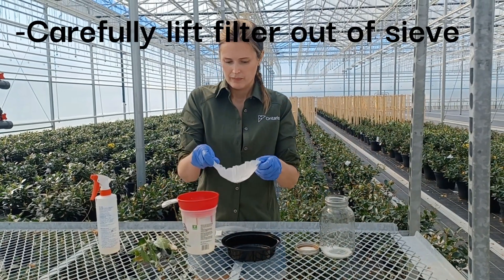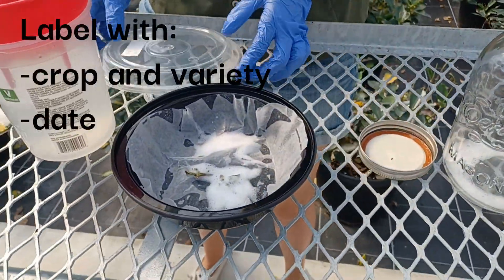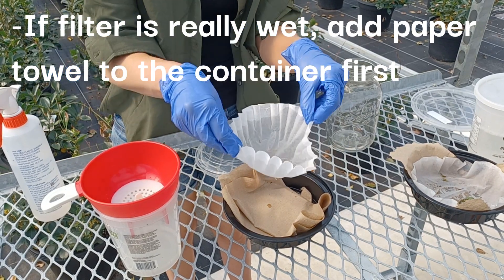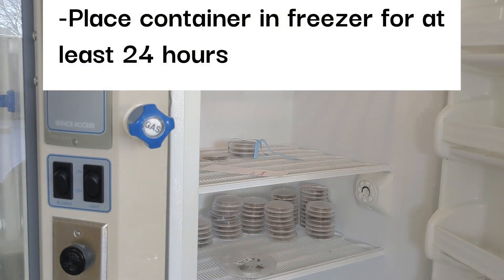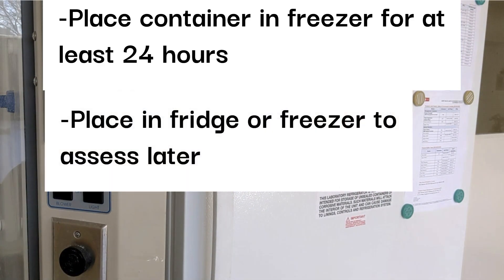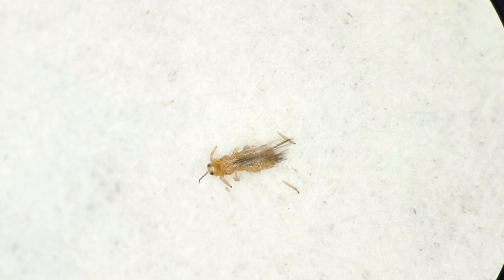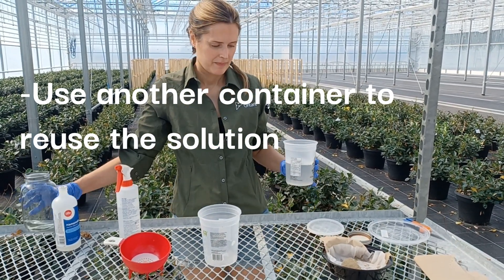Next, carefully lift the filter from the sieve and place it as flat as possible in the food container. Make sure to label with the crop and variety that you sampled and the date. If the filter is really wet, you can add a piece of paper towel to the container first. Whether you use the water or alcohol method, you will want to place the container in the freezer for 24 hours to ensure all insects are killed. The container can be placed in the fridge or freezer to assess later, but don't wait longer than 72 hours or the thrips or other insects will start to dry out, making identification and counting more difficult. Have another mason jar or deli container on hand to reuse the solution for each sample so you're not wasting it.